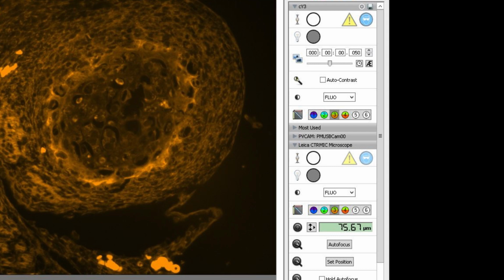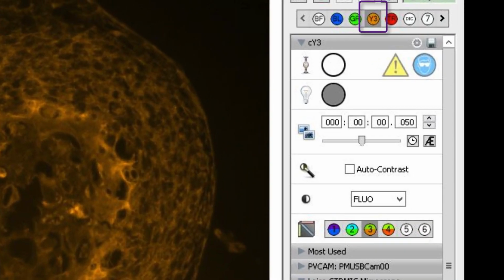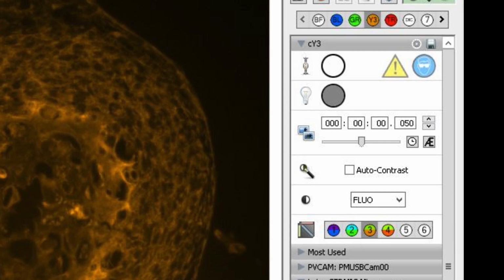While the program can control individual components, you will generally want to have preset configurations of your hardware in the combinations necessary to image each fluorochrome as well as your transmitted light paths. You can record the positions or settings of as many devices or as few as you require.